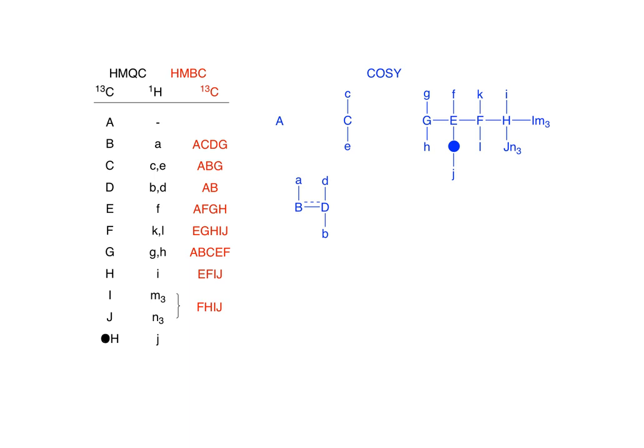Where things get more interesting is looking at protons B and D. As a digression, you'll notice that I've placed proton A and B trans to each other due to the large coupling constant noted for proton B.